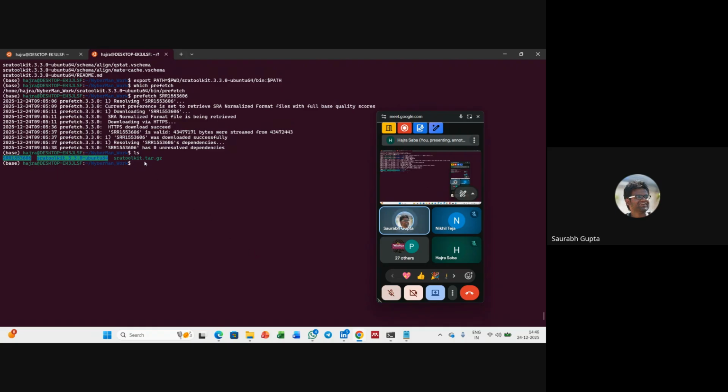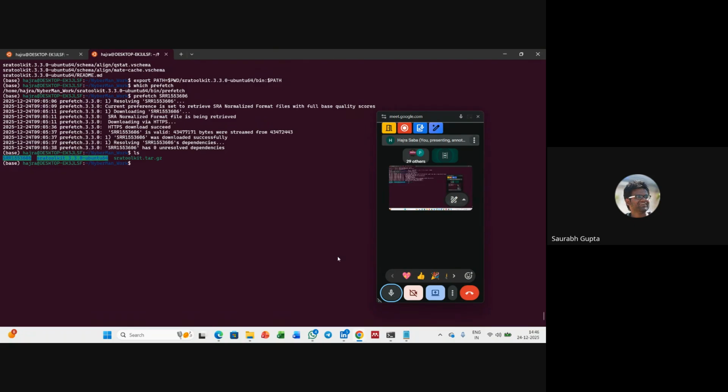So now go inside this directory, Hajra. You guys also, let's explore a little bit. So go inside this particular directory. How do you do that? CD and directory name. Exactly. Very good. The directory name is the ID name, that SRR ID.